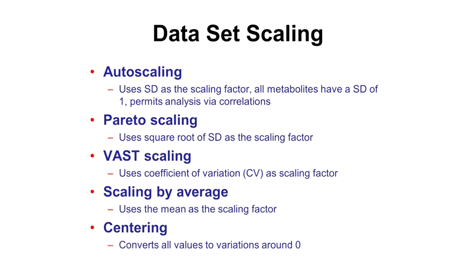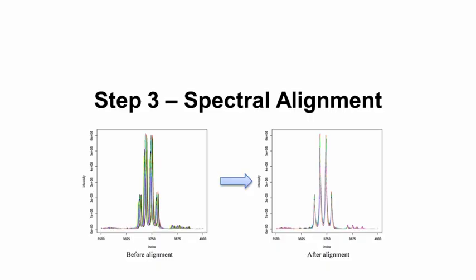These are critical techniques. They're also used in deconvolution methods or quantitative metabolomics, but they are particularly important for statistical spectroscopy. Another step that's really unique to statistical spectroscopy is something called spectral alignment. This arises when spectra are collected, and due to temperature variations, pH variations, salt concentration variations, or human errors, the positions of the peaks vary from spectrum to spectrum.